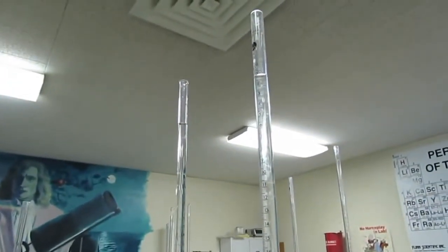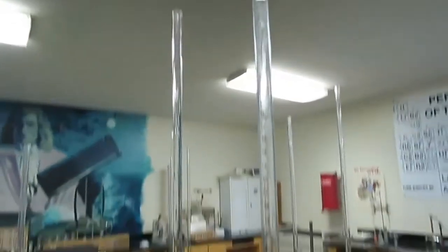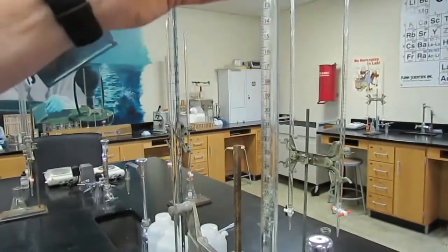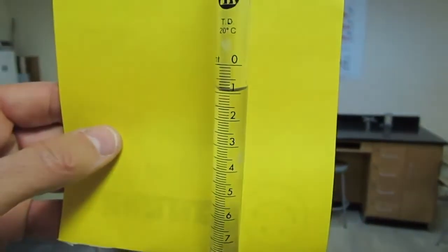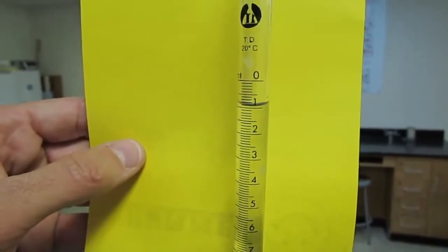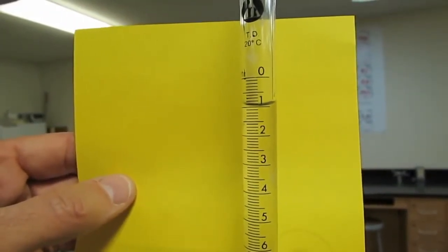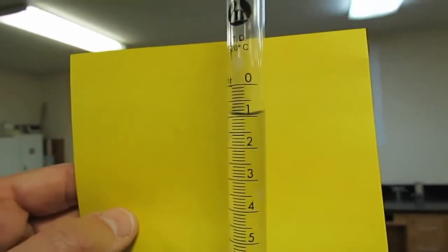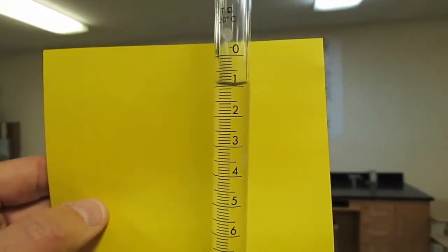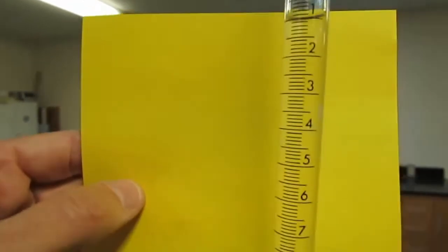So now our initial reading is taken by reading the bottom of the meniscus on our burette. So let's see how I can get this on video for you. I'm going to put a piece of paper behind this so it becomes easier to read, and you'll see that the bottom of the meniscus is between the 0 and the 1. It hasn't quite reached the 1 yet, so the initial value would be 0 point something. If I read the bottom of the meniscus, I'm going to get 0.9, and I can estimate the last digit, maybe 0.91, for my initial base reading.